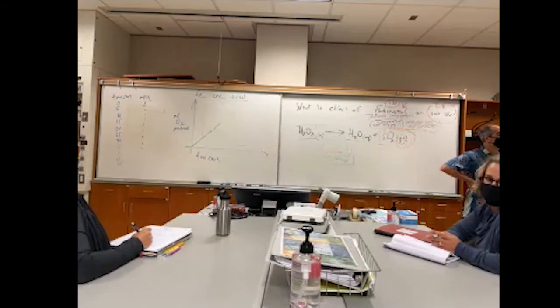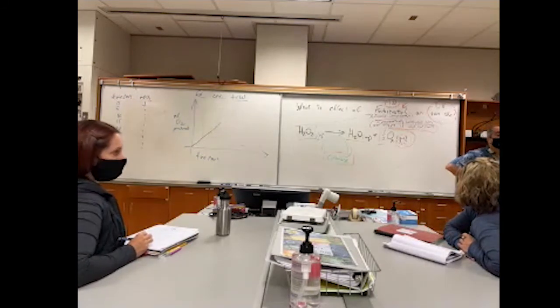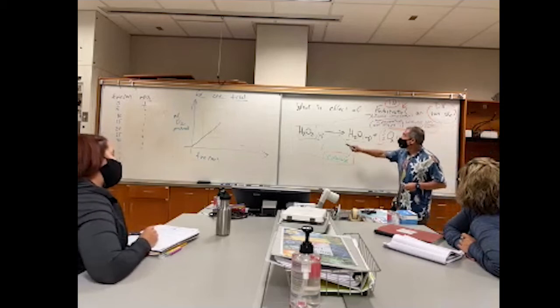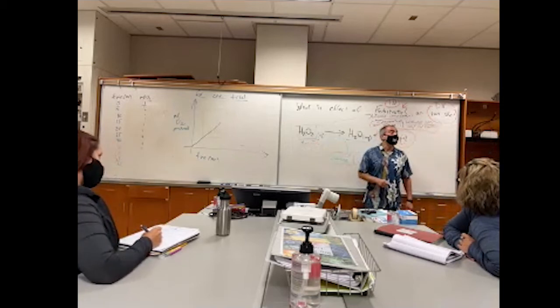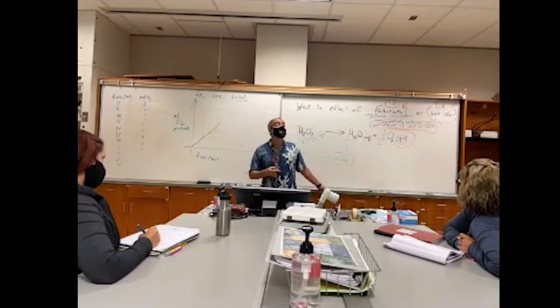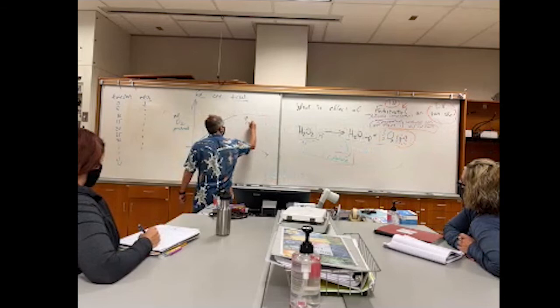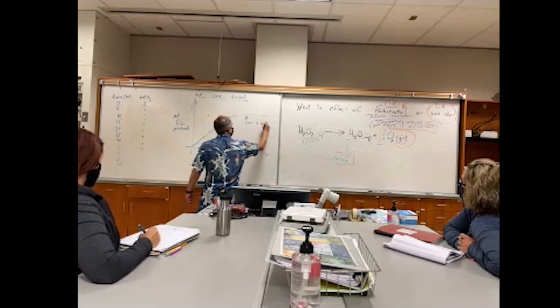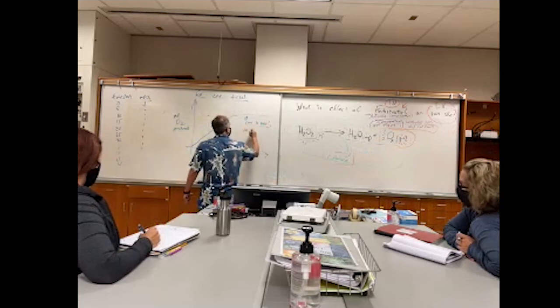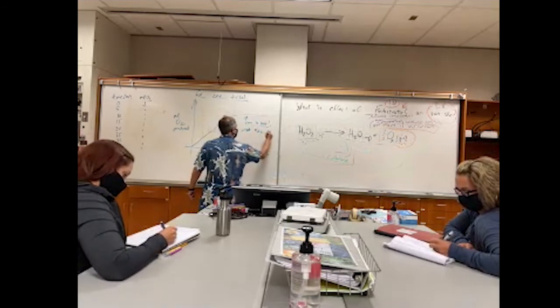Plateau as a reaction runs to completion. Exactly. So eventually, all the hydrogen peroxide that you started with is broken down. There's nothing else to break down. There could be enzymes floating around, but there's no substrate. So eventually, the reaction is over. All the H2O2 has broken down.